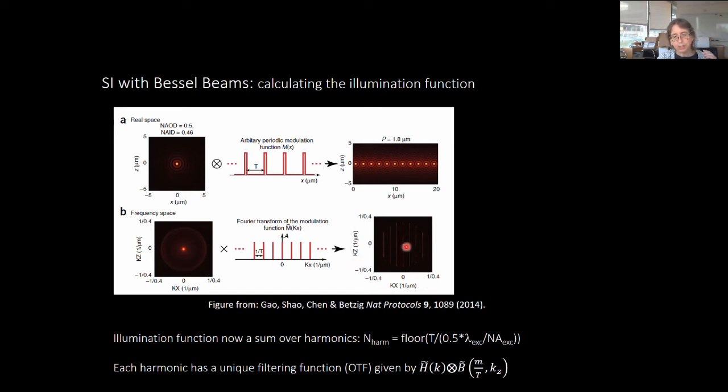And if we follow, in order to get the illumination function in X and Y, we follow at Z equals 0 out from low frequency in the middle to high frequency out here. And you can see it's going to be a series of delta functions. It's dark and then it's just bright at these harmonic frequencies. So it's going to be a series of delta functions that looks a lot like the one-dimensional example that I just showed you. Going in Z, it's more complex.